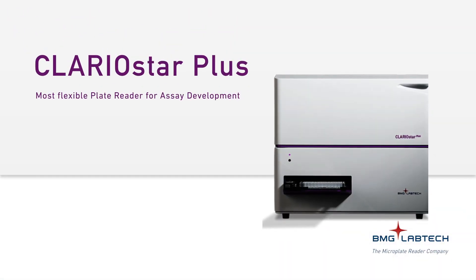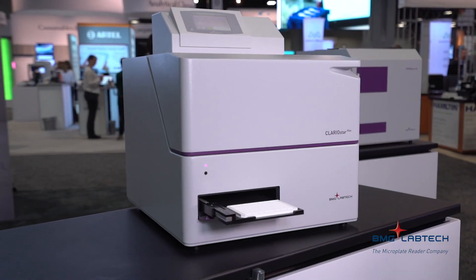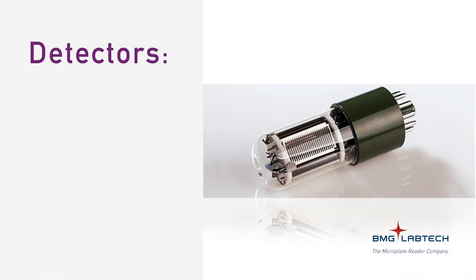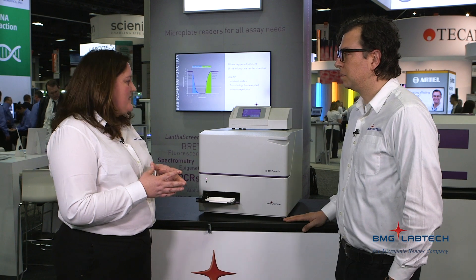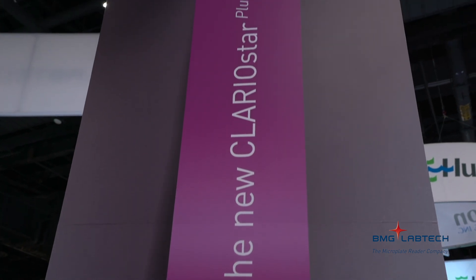The Claristar Plus looks a lot like the old Claristar. Is there anything new in this thing? Well, it does look similar, certainly from the outside, but a lot has gone on on the inside of this instrument. I would probably talk about the addition of our redshifted PMT — photomultiplier tube — in addition to our low-noise PMT, that's great up to 750 nanometers. This redshifted PMT, suitable for dyes up to 900 nanometers, means you always get really great performance. You don't make compromises if you want to move that way.